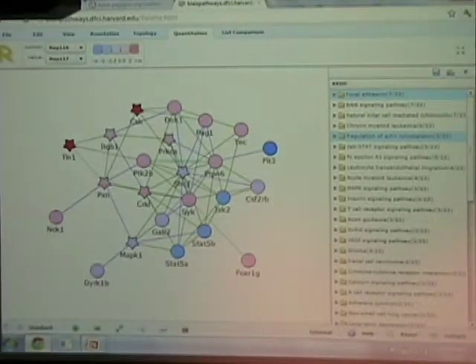But basically, and this is a very crude color coding, so these are significant ratios. Also, I forgot to mention, just in case it wasn't clear, the labels in iTRAQ are named after the masses of the reporter ions. So 114 is the mass that you will see for the 114 labeled sample. And so this tool, one area where we could improve is instead of these anonymous 116, 117, there should be a way to represent as a string what was the actual experiment. But if you upload the data, you typically know. But that's an area where we could improve a little bit.